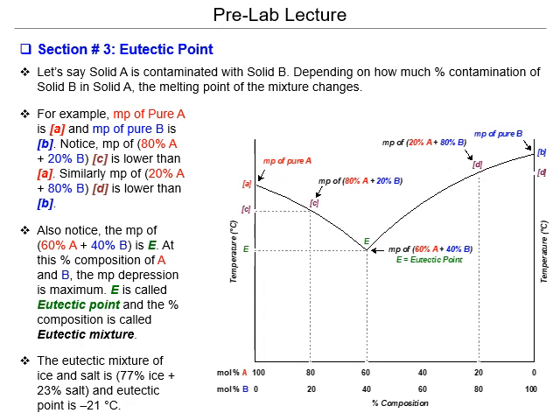What we're going to look at is that at A, where we have pure A and no B, you notice it has a specific melting point, and as you start increasing the percentage of B in A, it starts to dip down. It dips all the way down to point E. Then as it goes to the right on the graph, you get more and more concentration of B until finally at the very end you have pure B.